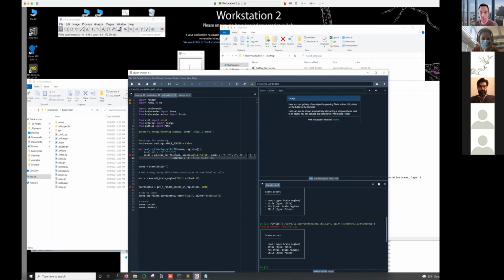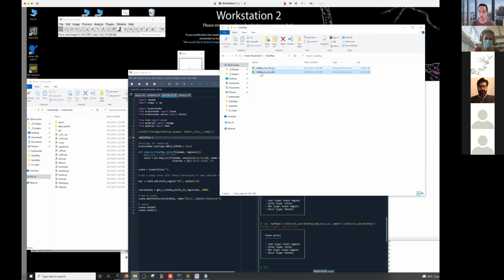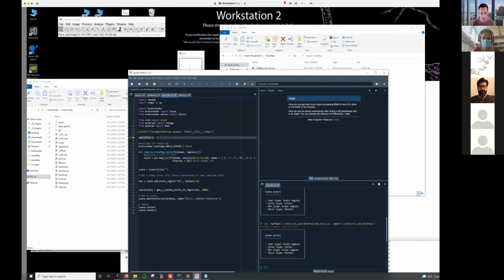And we should just give them some names so that we know what they are. And then we can also just skip the header row because that's just going to be the titles. We don't need that. And the other thing we need to do is just tell it where that CSV file is. So you can give it the location of the file. And an easy way to do this in Windows is to find the file and hold down Shift and then press the right mouse button. So if you're holding down Shift, you'll get an option here called Copy as Path. And this will make it easy for you to just paste in here the location of that file. So if I paste now, I get this clear path to the file.